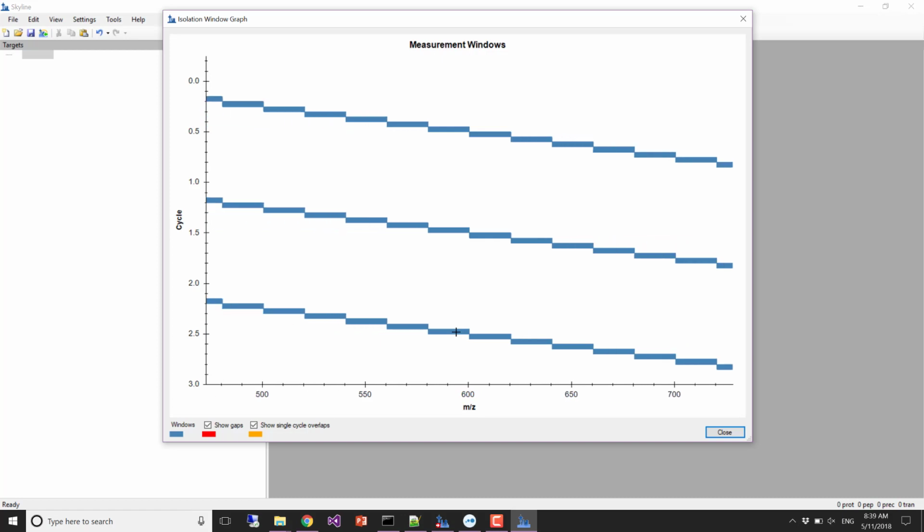And that's why it's okay not to have margins, right? Because there's some region, the peptide's not going to fall on the boundary, and it's probably going to fall at least 0.33 MZ away from a boundary, if we're measuring charge 2 and charge 3.